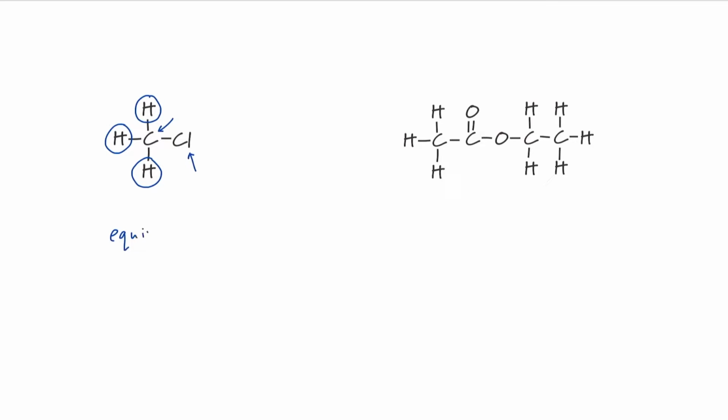Now, these protons are said to be equivalent. As far as they're concerned, they're all identical. They're all in exactly the same chemical environment. So on the spectrum, we would expect to see just a single peak. We have one proton environment.